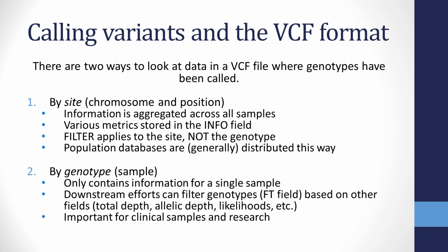Alternatively, we can look at it by sample. And by sample, basically, we're interested in the genotype of a particular sample. This is exactly what you would expect for, say, clinical purposes or research purposes, where we're really interested in the actual genotype calls of a patient, for example. And then we can filter this using a variety of downstream efforts.